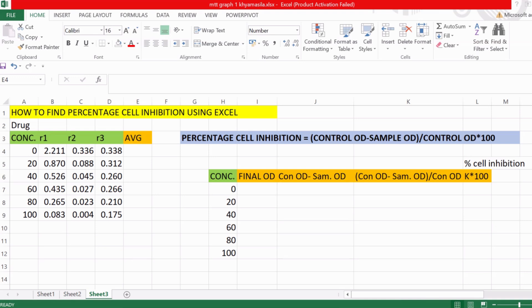Percentage cell inhibition has a formula: ctrl OD minus sample OD, divided by ctrl OD, multiplied by 100. This formula gives us the percentage of cells that are getting inhibited at different concentrations of the drug. This will become more clear when we come to the example.